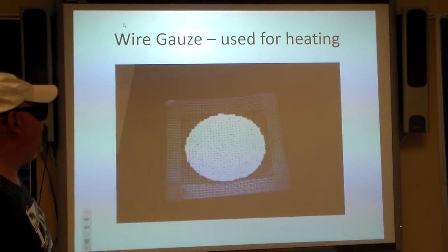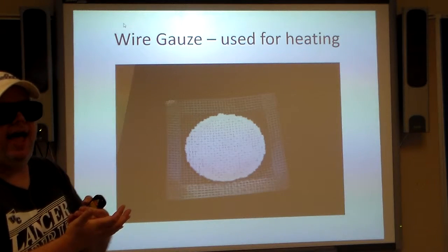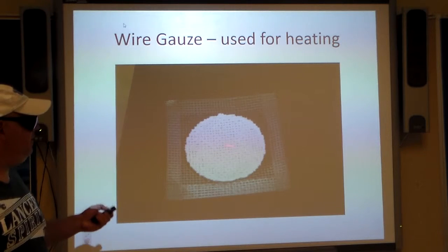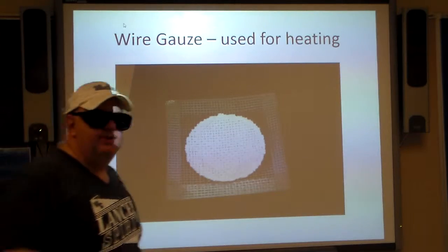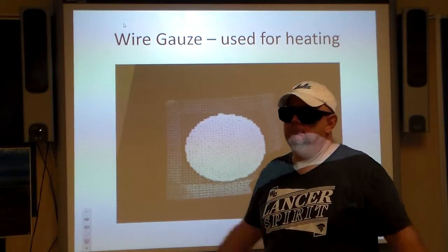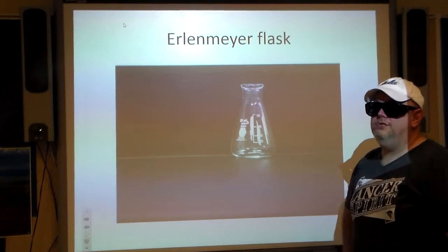Wire gauze — we're going to be using the Bunsen burner, heating things up, and sometimes we need this to help prevent too much flame from hitting the glass or the porcelain crucible we'd be using. You basically have a wire screen with a white powdery material — it's not asbestos, but it is some kind of fire retardant. You cannot set this on fire.